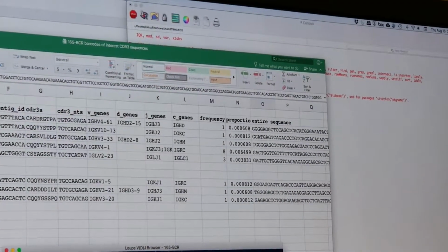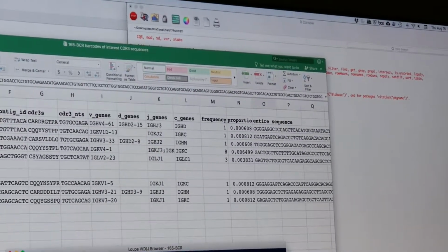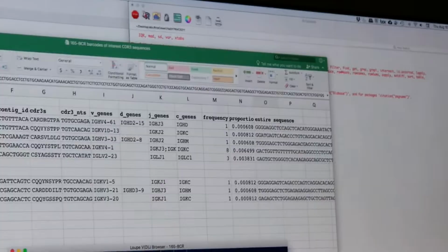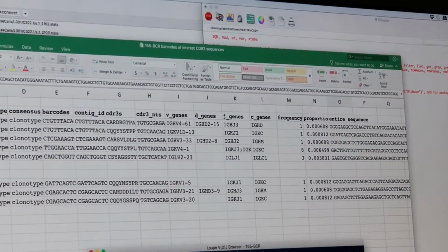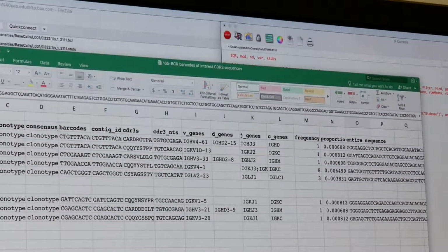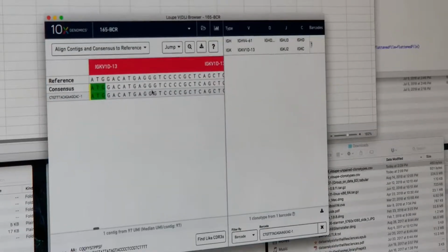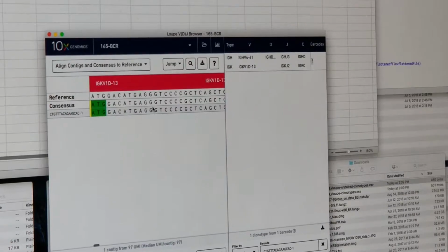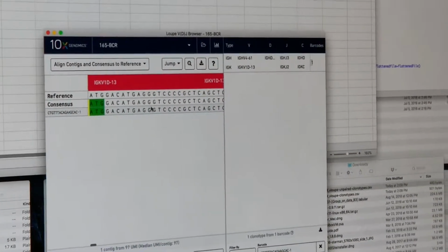It's just really manually. No, I know. We only have a few sequences, just like before, so we can do it manually. Remember, I just did it manually. But what program did you use? IMGT or whatever, IgBLAST? I bet there are some tools out there that have been around for ages. I never convert stuff to amino acids. Back in my proteomics day, I used to have to convert, but now I'm in genomics. I don't really care about the protein sometimes.